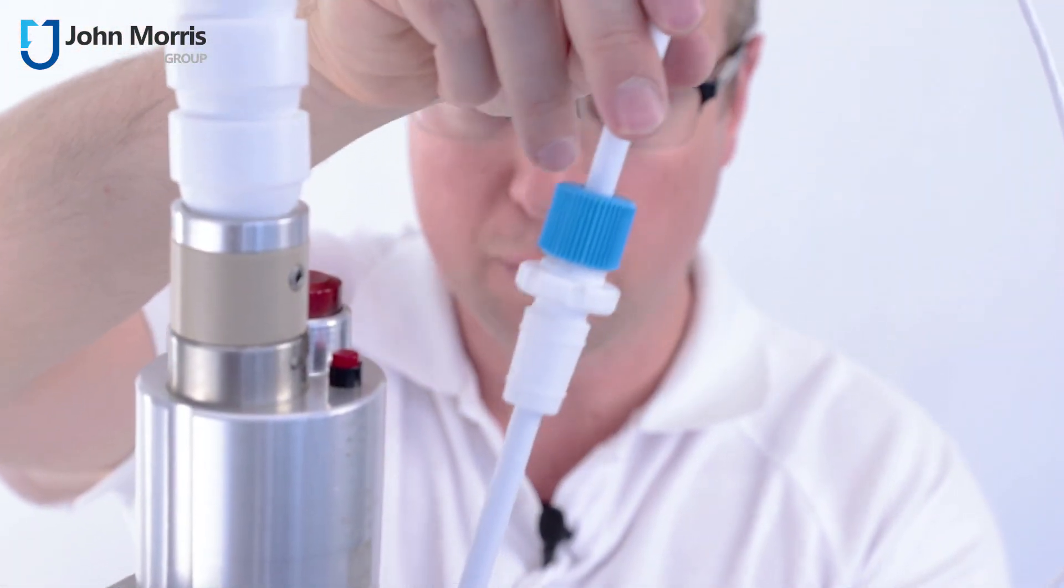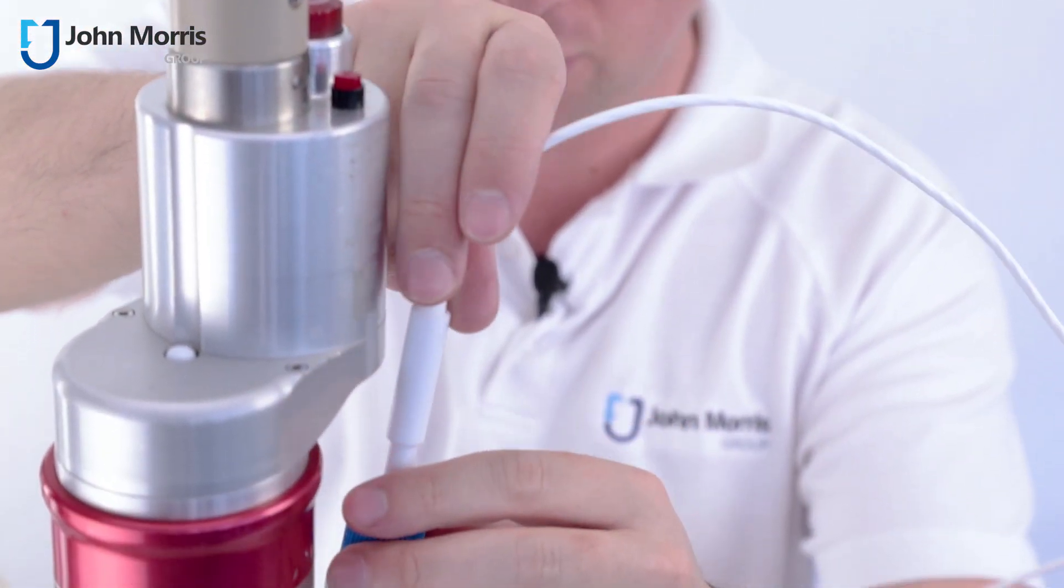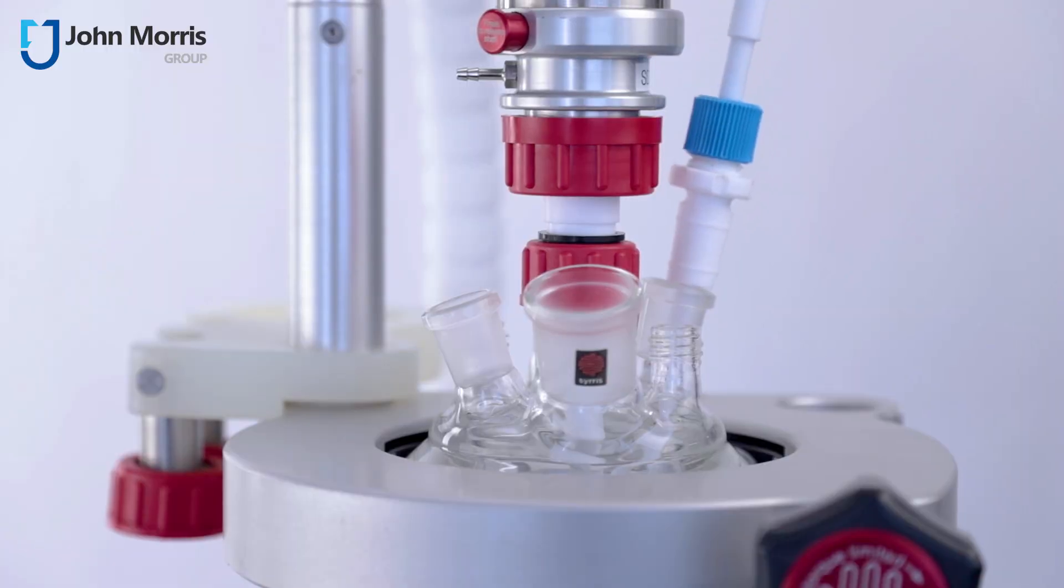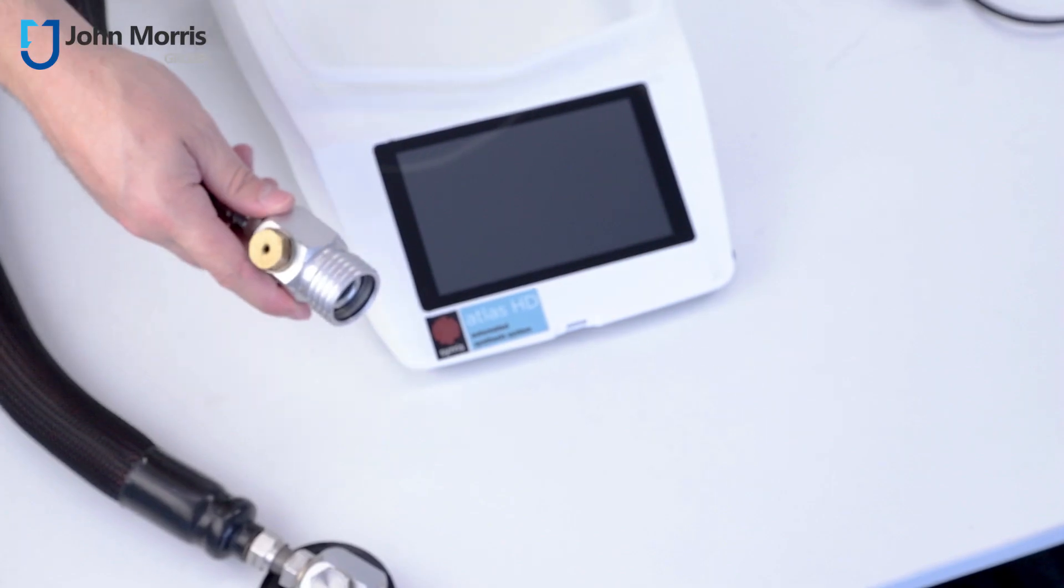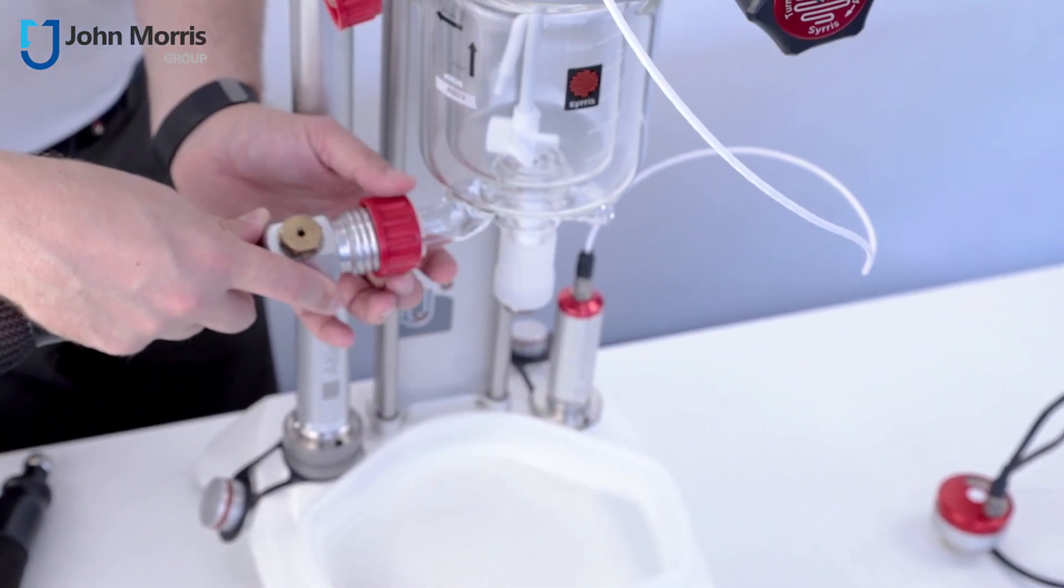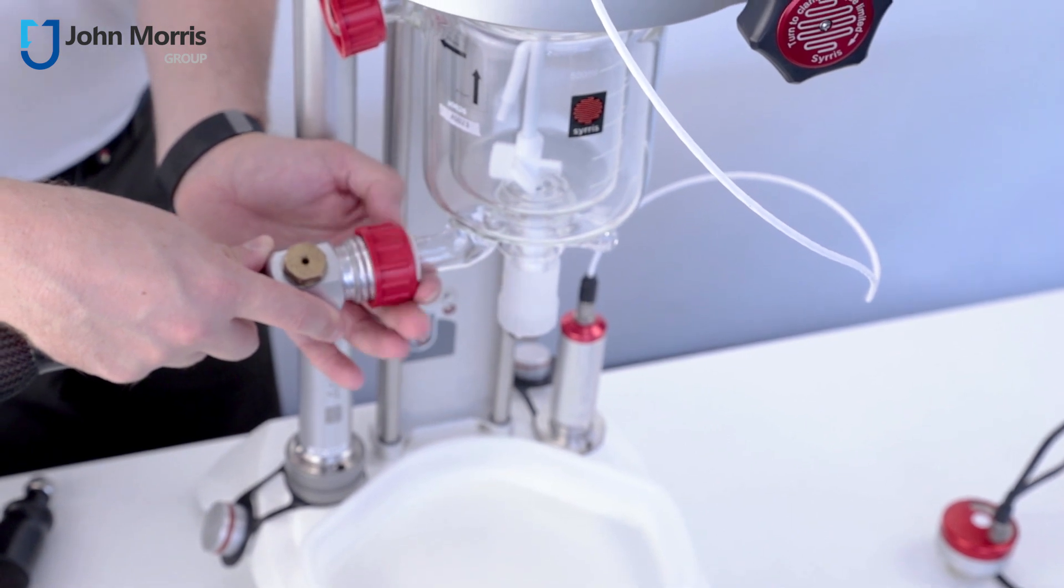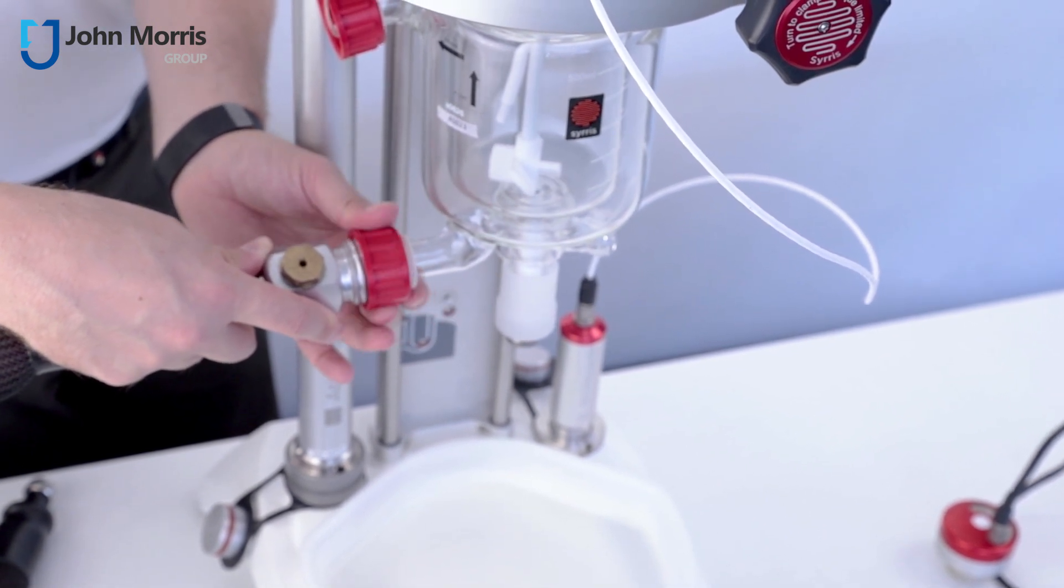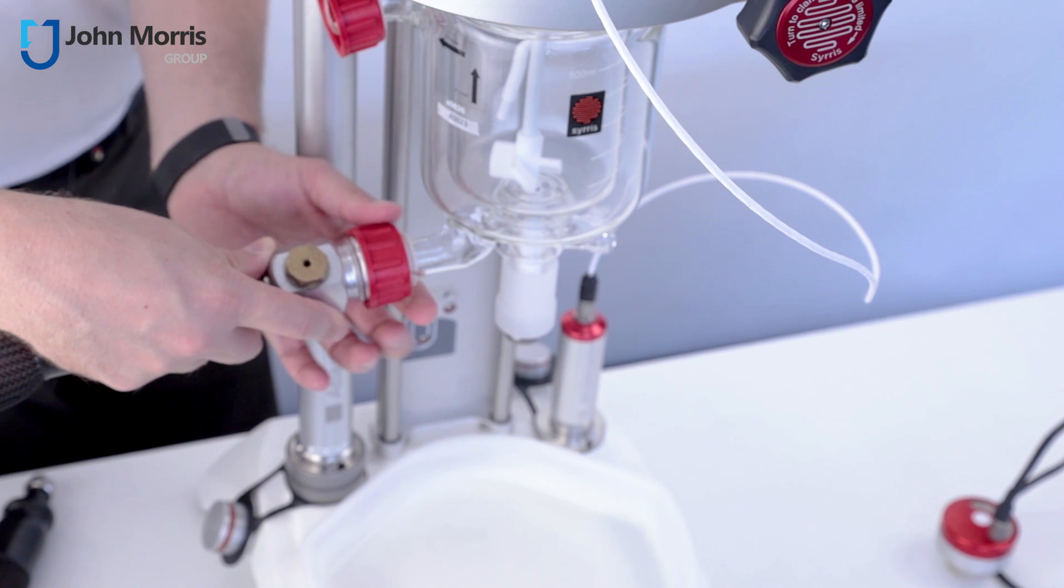Now we're going to put in one of the probes, in this case it's a temperature probe, and away we go. Finally we're going to put on the tubes for our jacketed reactor and again no tools required, just finger tighten.